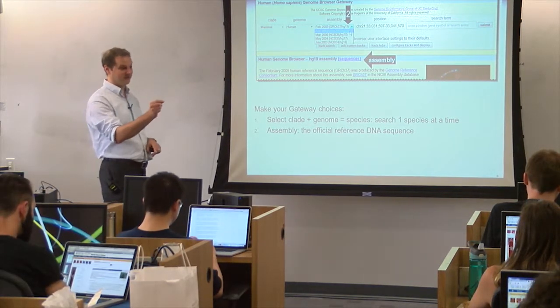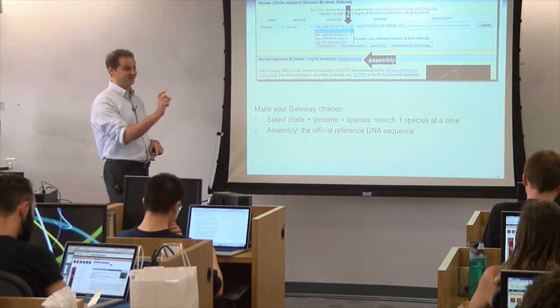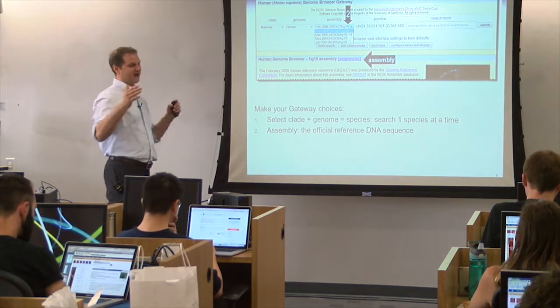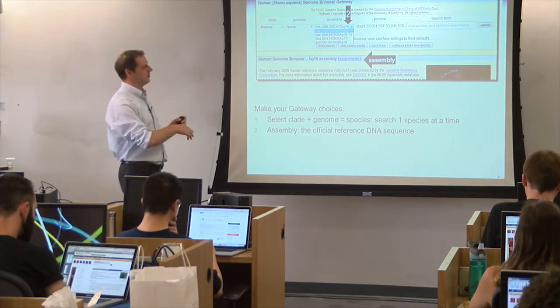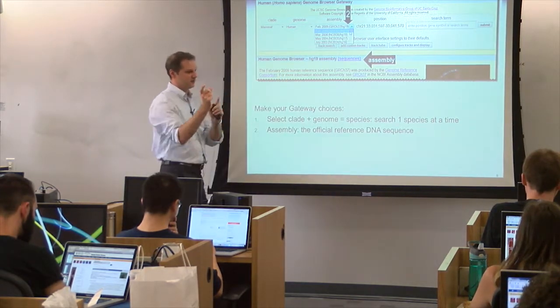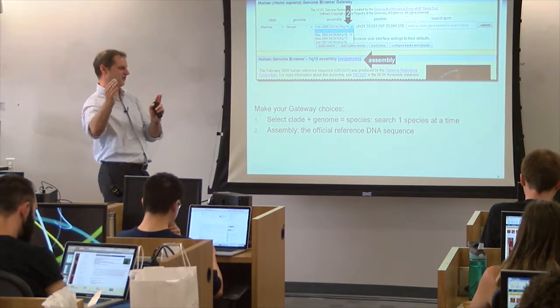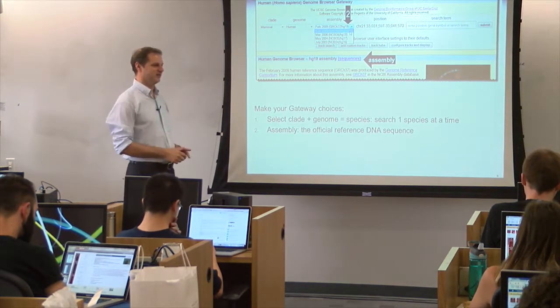The coordinates associated with a gene will differ, but essentially there'll be big chunks of the DNA that are directly comparable from HG18 to HG19, and maybe there'll just be a complicated region that somebody resolves that will now shift everything after that, the coordinates off.